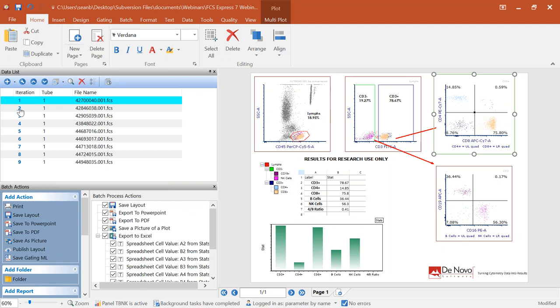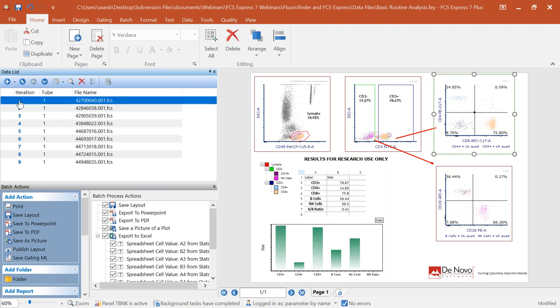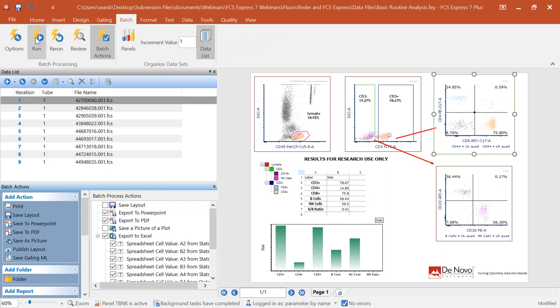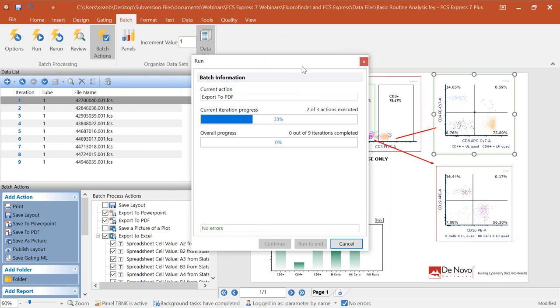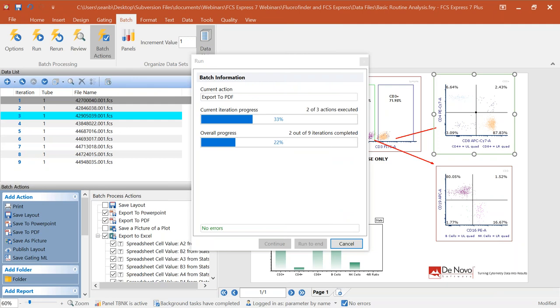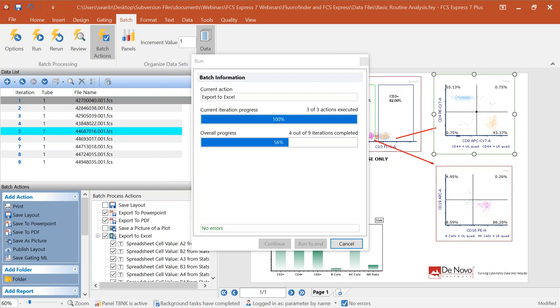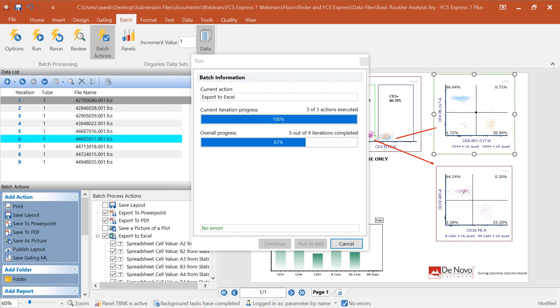If we have many data files, as you navigate through them using the data list, all information and charts update immediately. When you're ready to export results to PDF, PowerPoint, or Excel, you set up what we call batch processing in FCS Express and simply click Run. FCS Express is going to export to PowerPoint and PDF, generating output for as many data files as you have in the data list. There's no upper limit — the most I've seen analyzed at one time is around 20,000 to 30,000 data files.